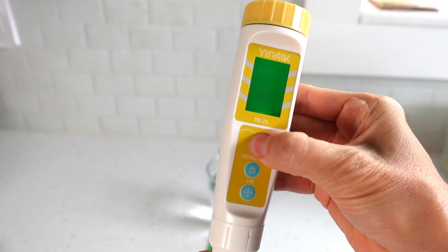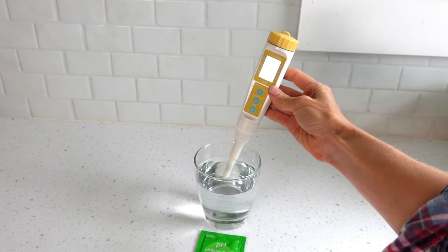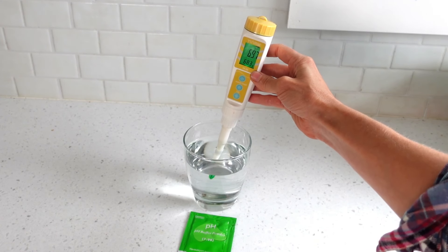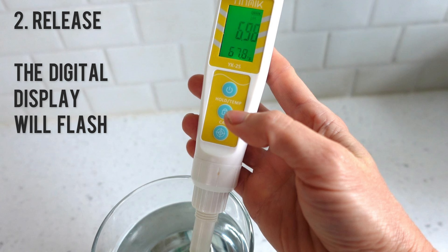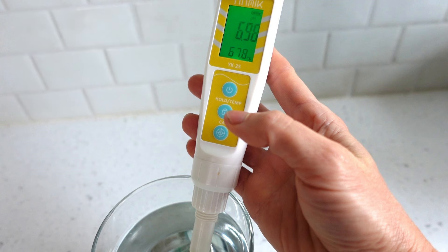Turn the meter on by pressing the top button. Place the meter in the first pH buffer solution. Give the meter a swirl in the solution, then wait a moment for the pH to stabilize. Here's a heads up on how the calibration process works: you will press and hold the bottom calibration button down for five seconds, then release and the meter's digital display will flash. Keep the meter held in the solution until it is done flashing. Here we go.